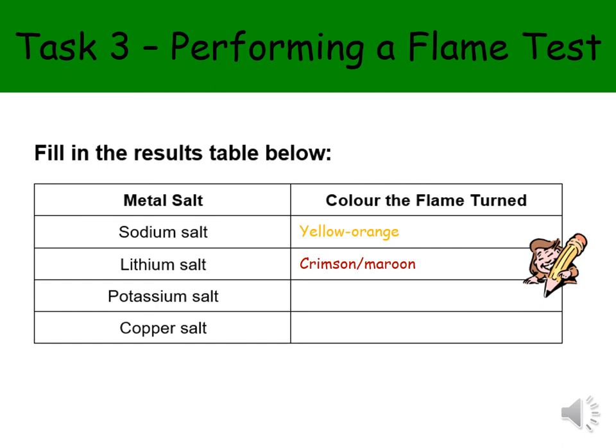For potassium, this one was a little bit more difficult to notice. You had to look very, very closely. And if you did manage to look closely enough, you should have seen a lilac flame. And the final metal that I burnt was copper. And I'm hoping all of you would have noticed that lovely green colour that the flame went.